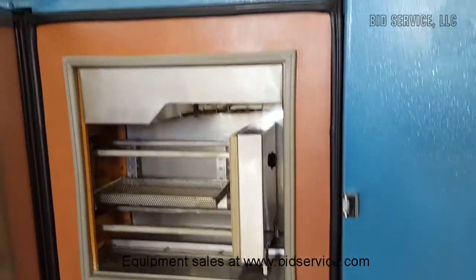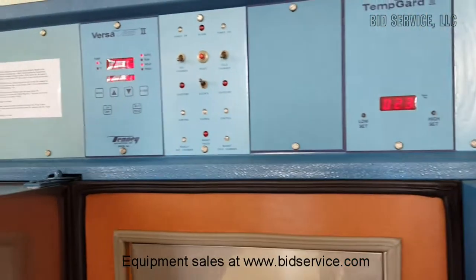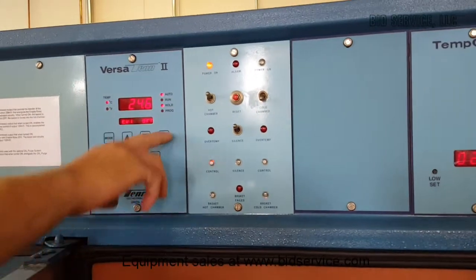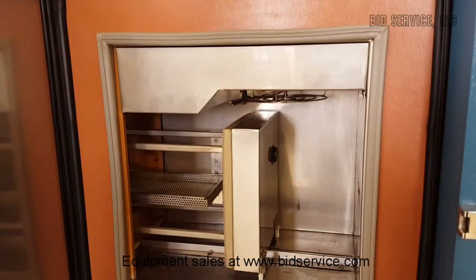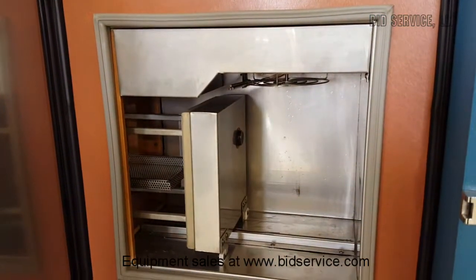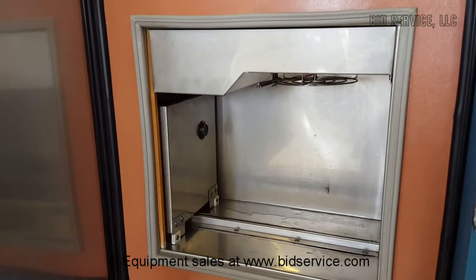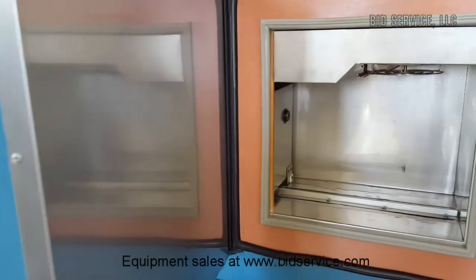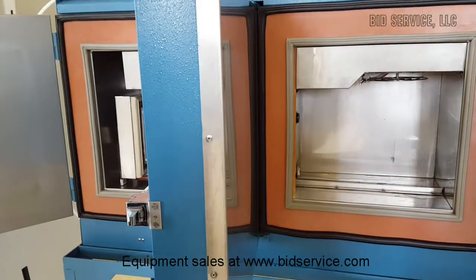I'll show you the transfer system in manual mode. Now what we'll do is we'll turn it on and let it get to operating temperatures and we'll be back.